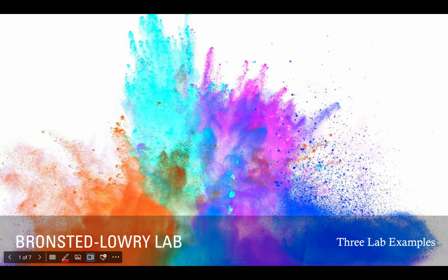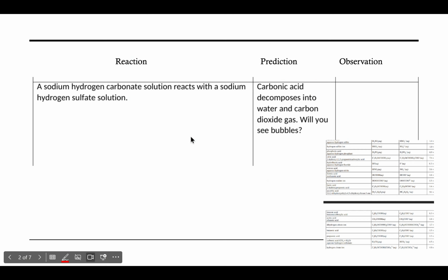So here I have an example of a lab I did with my class today, and I just picked 3 of the labs to show because it was at different parts of the lab. And it's showing Bronsted-Lowry and predicting reactions and then testing those reactions out. So for the first one we're taking a look at, we had sodium hydrogen carbonate reacting with sodium hydrogen sulfate.